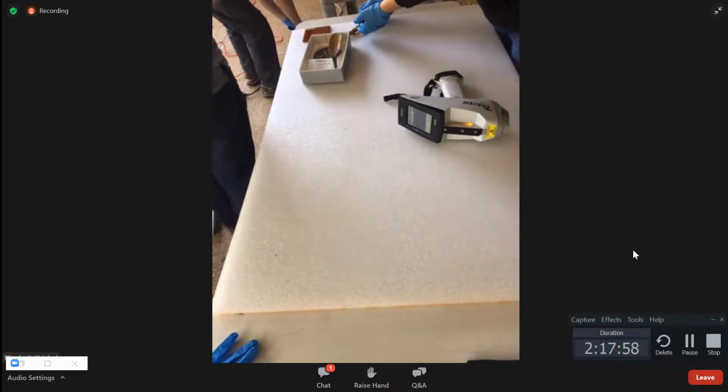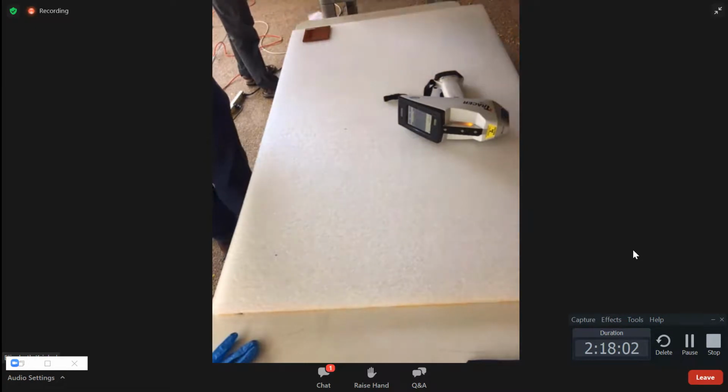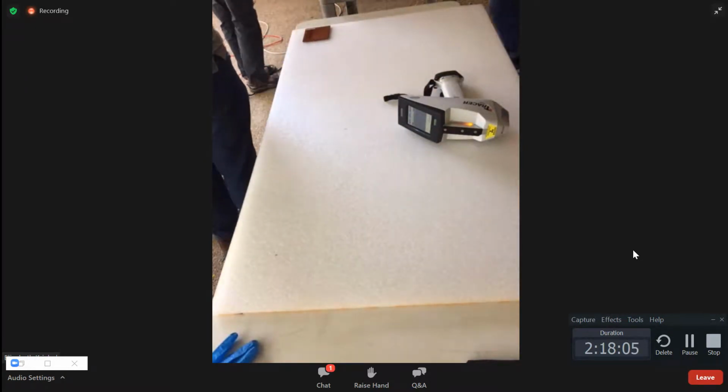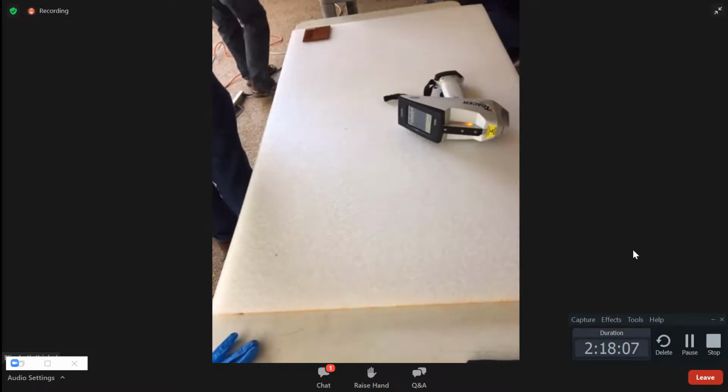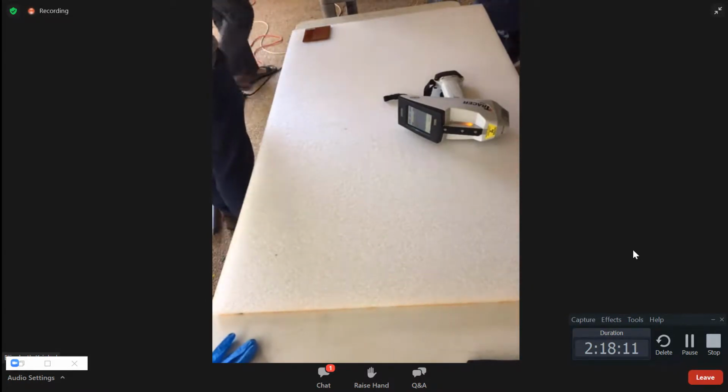Yeah, we can only measure the tassels because there's beads everywhere, and so the outer edge of it we can't get. But the tassels of it absolutely have been treated with mercury. Or they've got some, I saw a red color there. It might be vermilion, but either way.